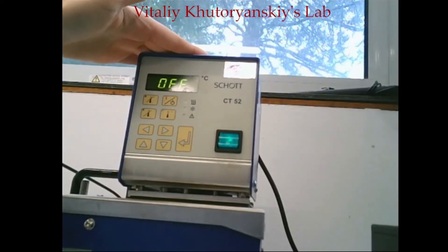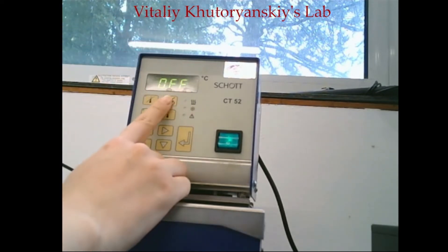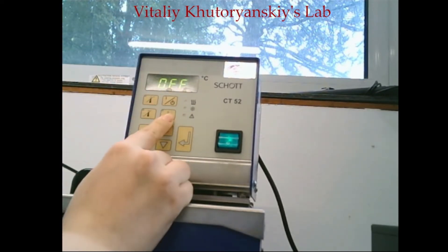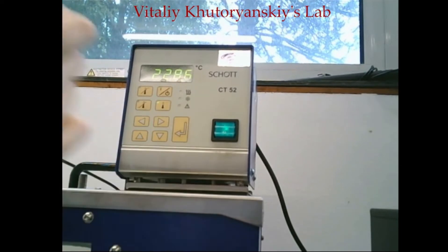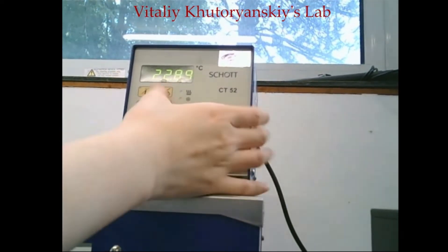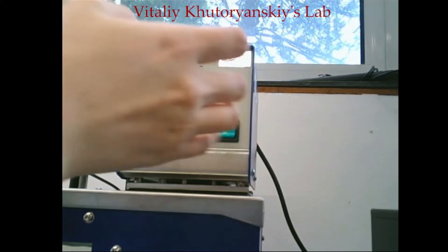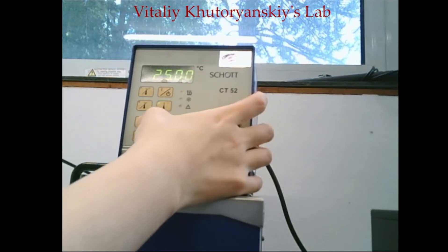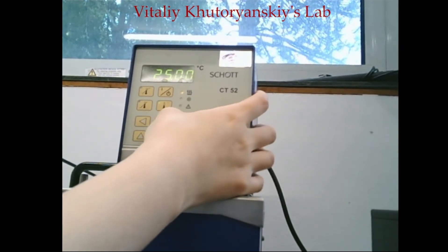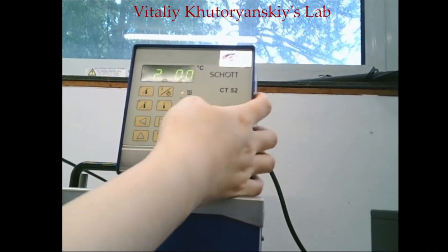Here is the control panel of the thermal set. This button is the start or stop key, and this is the working temperature. First we open it. The temperature is currently set at 25 degrees. If you want to change the temperature, there is a cursor key to shift left or right, and here is the button to increase or decrease the temperature.